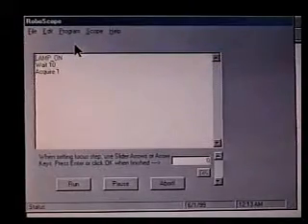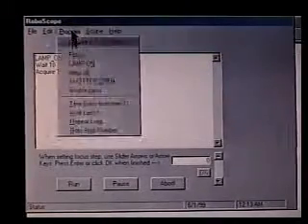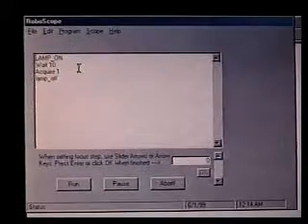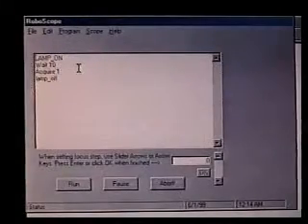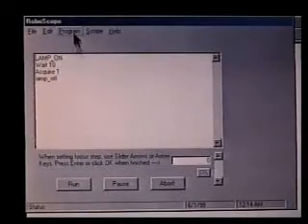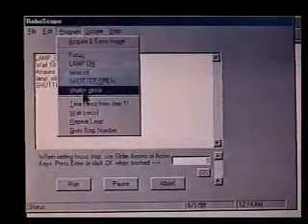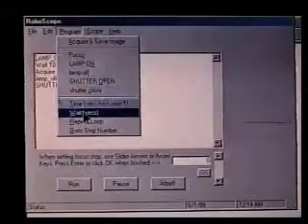Then we'll turn the lamp off, and then we will open the UV shutter. And we'll give that a little bit of time to stabilize as well.